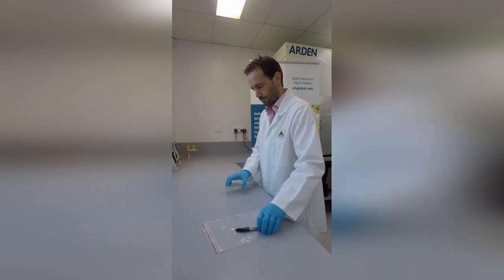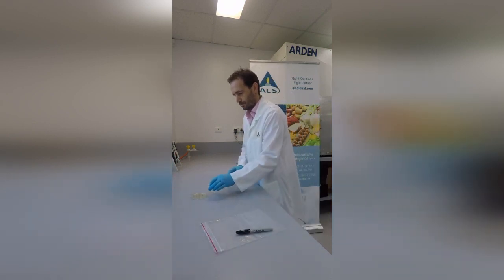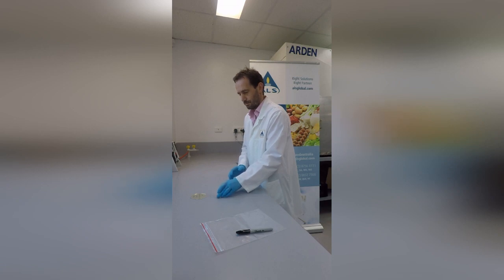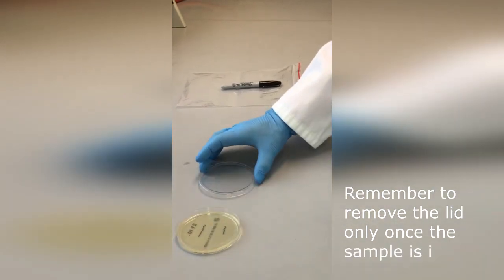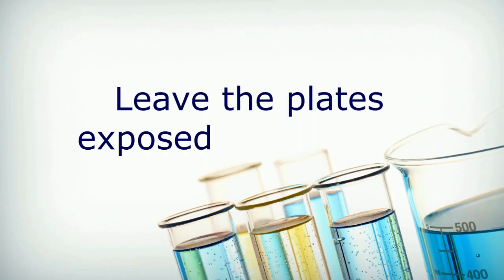Place the plates in the sampling positions with the lid still on. Remove the lids to expose the surface of the medium, resting the lid face down on the surface next to the plate. Take care not to put fingers on plates and avoid passing anything over the top of the plates being exposed.